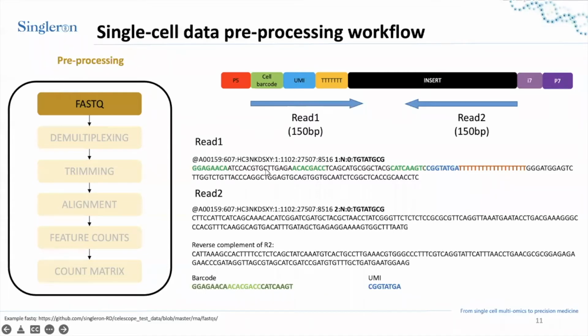And then here, the black color in between the cell barcode are the linker sequences. So the linker sequences help the bead, remember there is a bead on the left side, to continue synthesizing this sequence. And then later, we can make use of the linker sequences to remove the read 1 with lower qualities.